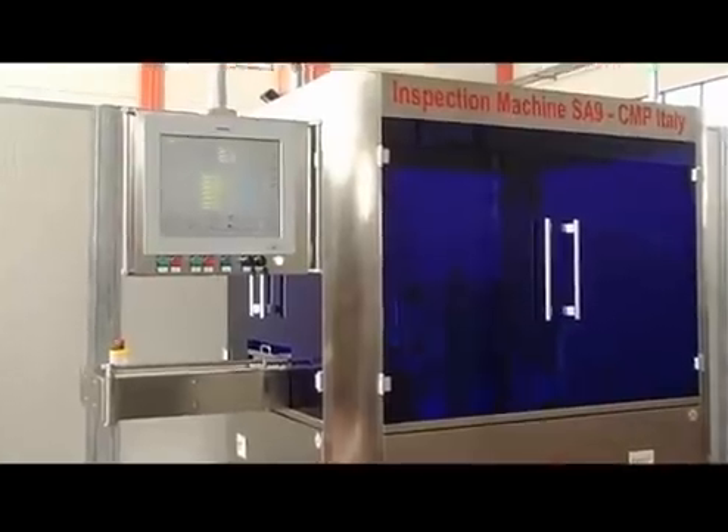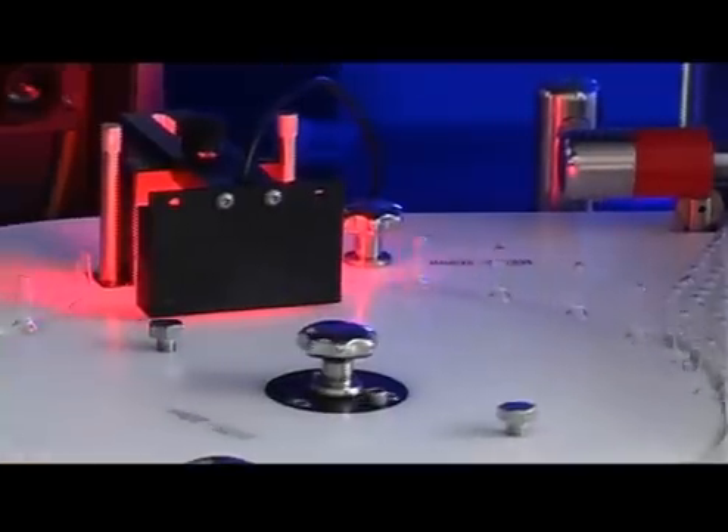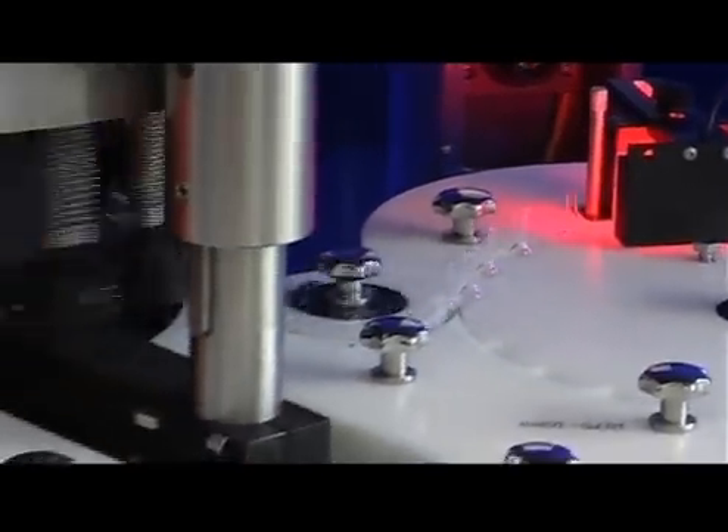CMP inspection machines are produced with highly advanced vision and control technology, including high resolution digital video cameras, illumination systems with high efficiency LED components, and appropriate optical elements for the visualization of images.